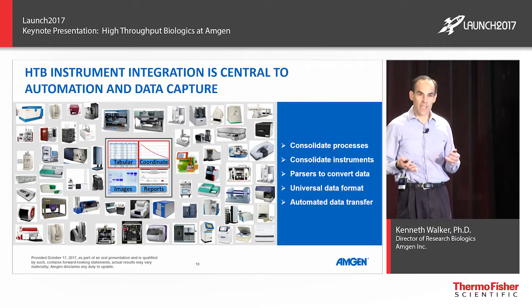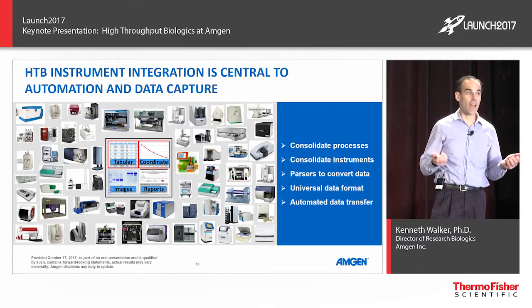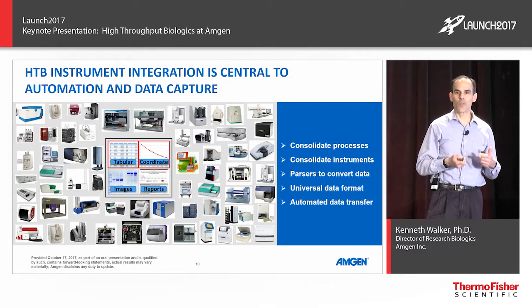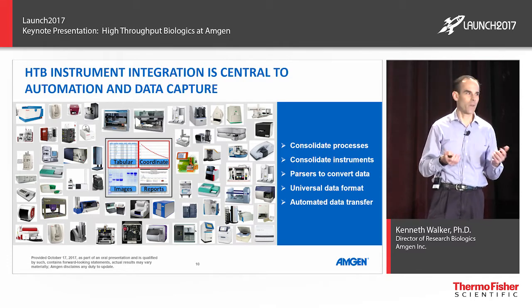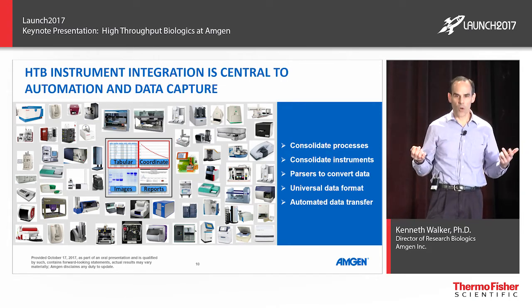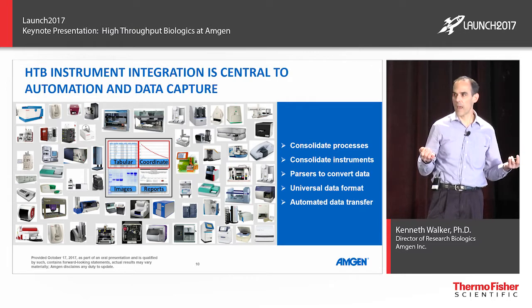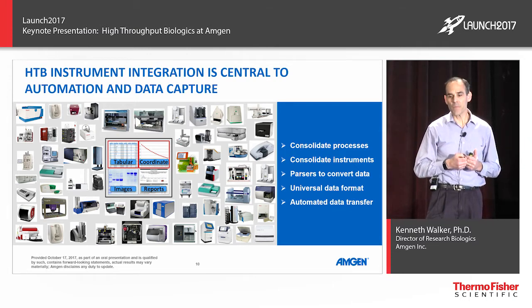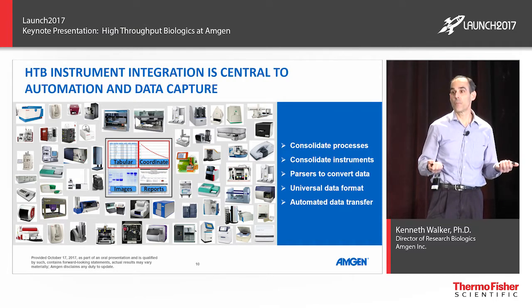Along the way, though, we did learn a few things. As I mentioned, we have 7 different research sites for biologics, and the tendency is for sites to develop their own ways of doing things, and that's not very compatible with having a universal type of LIMS system. So we've had to work closely with all these sites to see if we could settle on agreed upon, more universal processes, so that we can make it more compatible with the LIMS system. That's one of the side benefits of having launched this corporate-wide: we ended up with a lot of process consolidation, which really helps quite a bit with best practices.